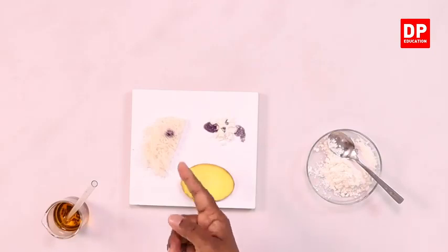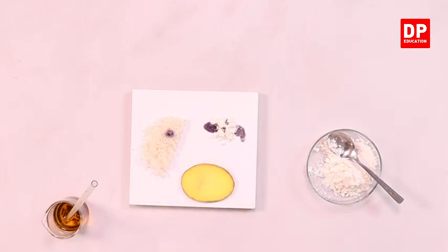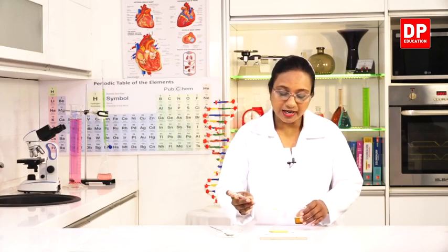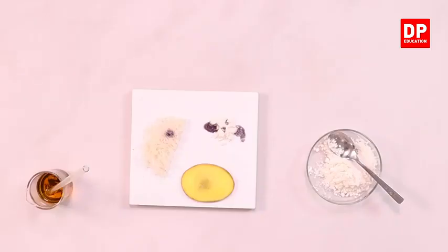You can see the color change, the appearance of purplish blue color or dark purple color in the piece of string hopper as well as flour, but the color is not very visible in the piece of potato. So I will add another few drops of iodine. Here you can see slightly the purple color appearing on the piece of potato. If you look at the center of the potato, you can see the color change.